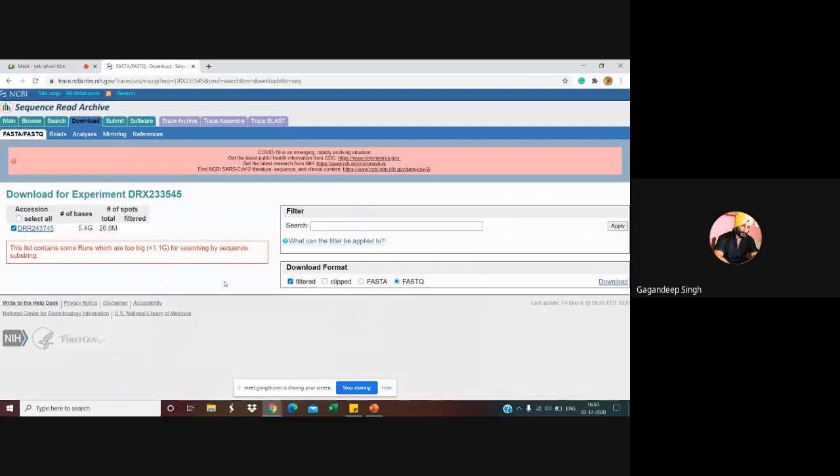This is basically the overview of NGS. Now how will we do NGS? The first step is to extract the data from NCBI, if the data is not generated by our own. This step is known as data mining.